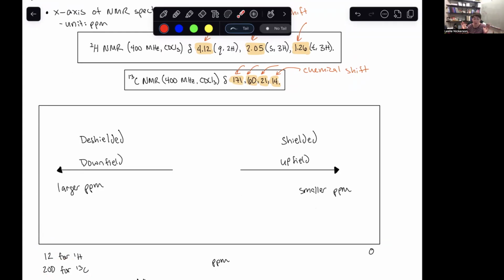Okay, so in a proton NMR, everything is really, really smushed down into one kind of small little area, 0 to 12 or 14. But in carbon, it's a much, much wider range that we're looking at in terms of our chemical shifts that we're going to see. So keep that in mind when we're thinking about that idea of overlapping peaks. Much easier for peaks to overlap in a proton where you just have less space to put them all. In a carbon, there's going to be less chance of overlap because you're going to be able to see different kind of minor differentiations a lot easier.